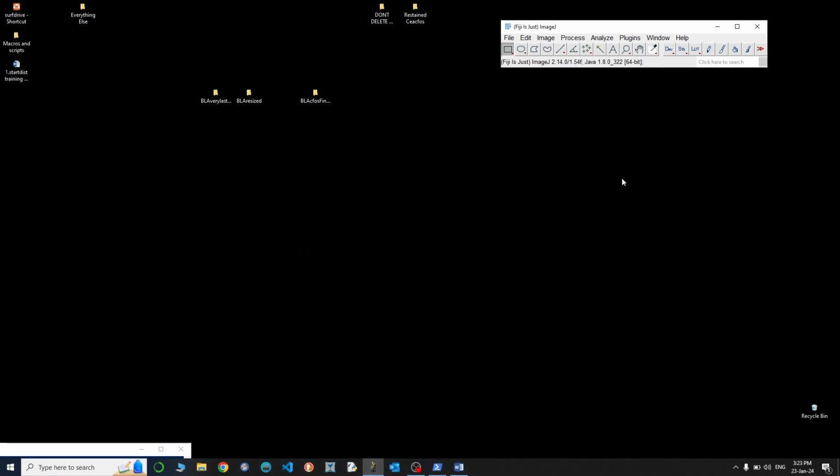We are in step 21, and if you're watching this video, it means that you have already manually corrected your regions of interest, and you have run some kind of validation in step 20 to make sure that your manual corrections made sense. So what we're going to do now is use the final objects of interest or regions of interest that we've collected to get measurements about them.